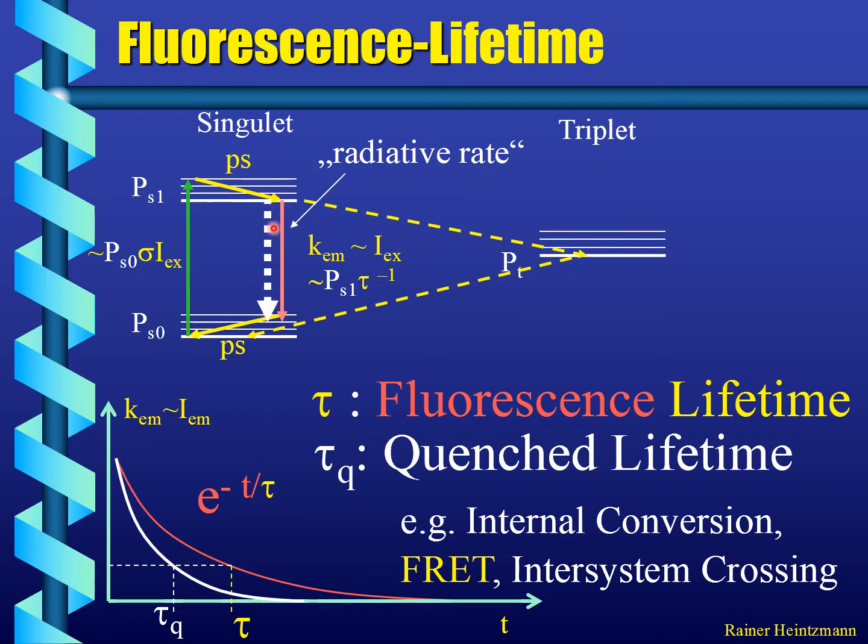So that is the non-radiative decay channel, and for example, the intersystem crossing in this direction, and in fact also other effects like Förster Resonance Energy Transfer, which is another channel for the fluorophore to get rid of some energy via Förster transfer to another molecule, and that also quenches the fluorescence lifetime. You call this quenching because the lifetime is reduced, and that would also reduce the overall brightness of your fluorophore, which is proportional to the integral of this fluorescence lifetime decay curve.